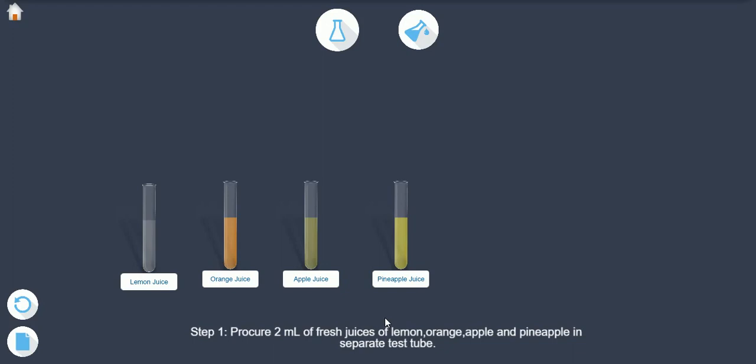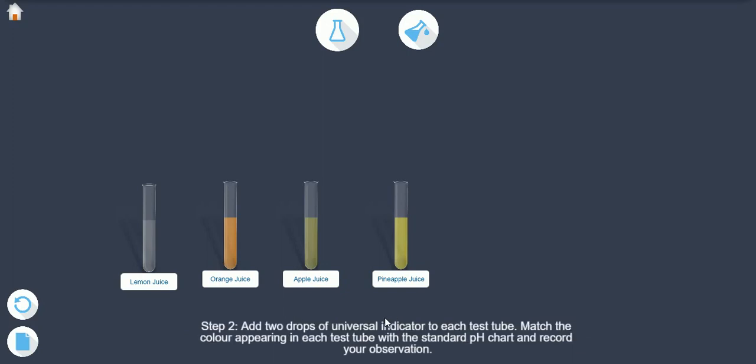Step 2: Add 2 drops of universal indicator to each test tube. Step 3: Match the color appearing in each test tube with the standard pH chart and record your observation.